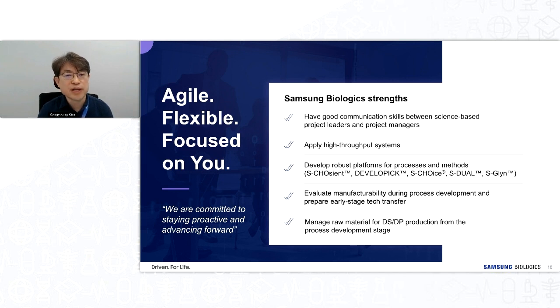Moving forward, we will continue to explore additional parameters for the in silico model by leveraging historical data. Regarding the filtration process, given it is focused on size or concentration, utilizing in silico analysis may not provide significant insight.